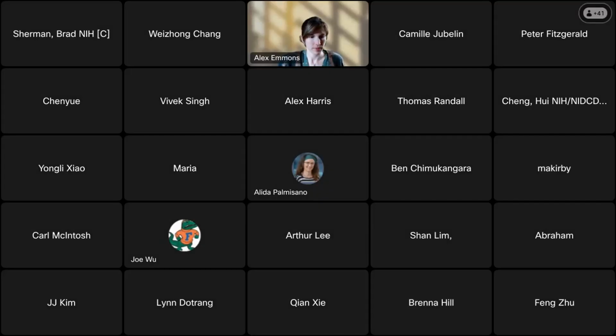Okay, Alex, guess we can take questions. Brad, that was an amazing demo, and I just wanted to thank both you and Weizong for being here and providing that introduction and demo for us. There are quite a few questions in the chat. I can read these out to you if you'd prefer that, and then hopefully some others can unmute themselves and ask questions as well.